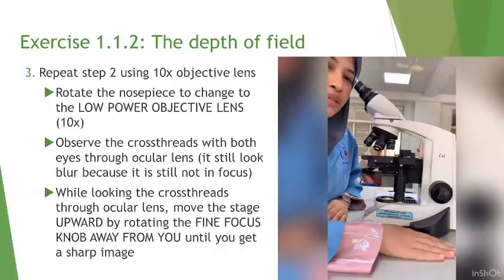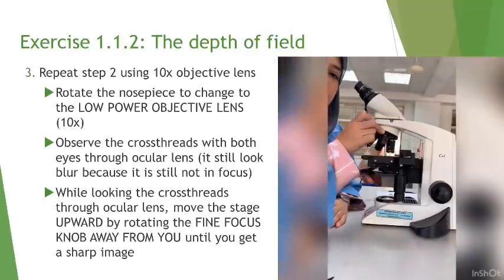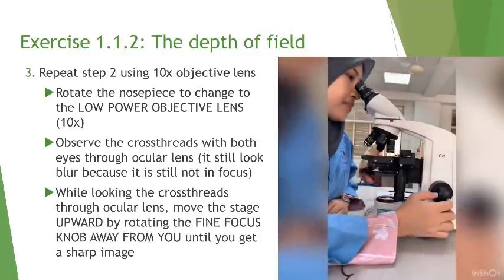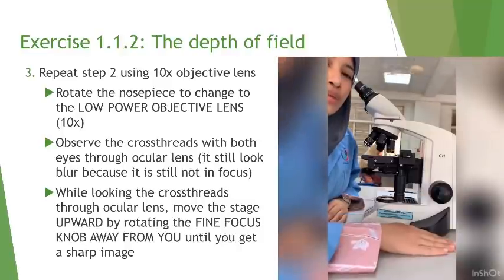Repeat the experiment using the 10 times objective lens. Rotate the nose piece and focus using the fine focus knob. As with the other parts, you have to determine which thread is located at the top, middle and at the bottom.